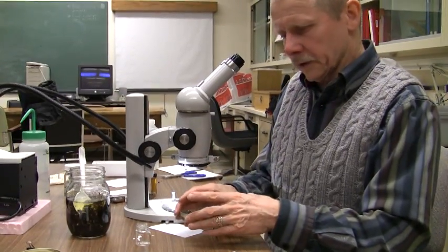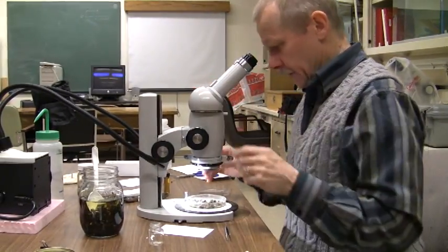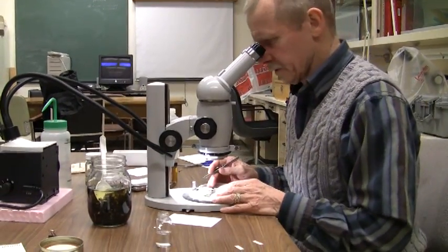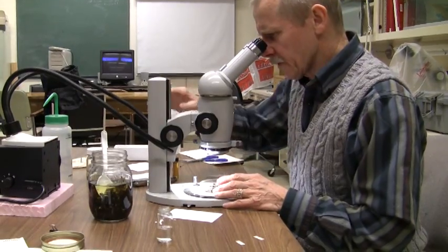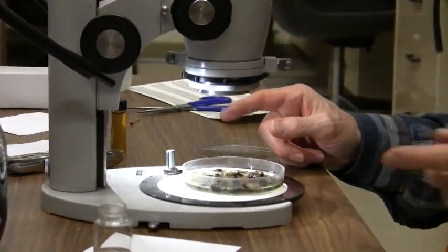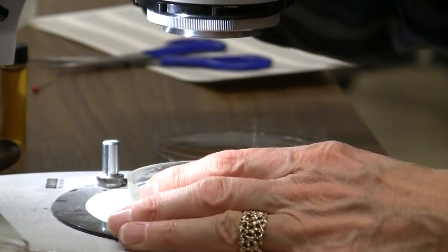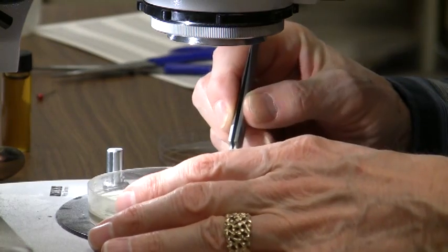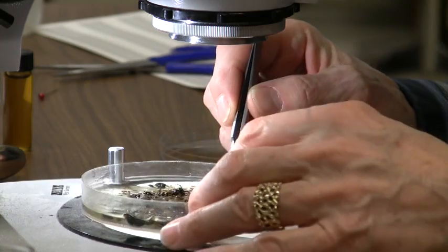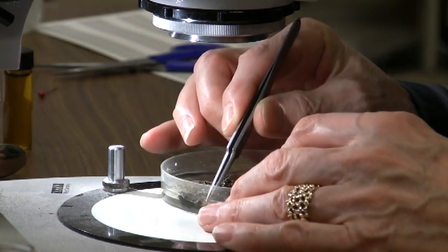You're going to do this sorting under the microscope — under low power, as low power as you can get. Just put the petri dish there and sort of search through it. You can either do this in a systematic way, starting at the top and moving back and forth, or you can just look around. Looking under the microscope now — wow, tons of stuff. It's quite remarkable. There's probably enough specimens here to make at least half of your insect collection, right in this particular dish.